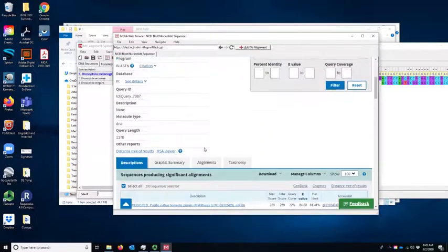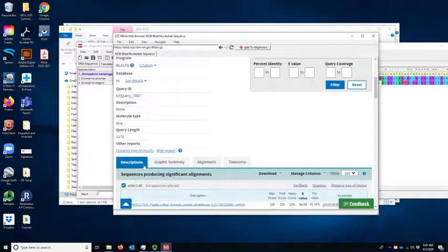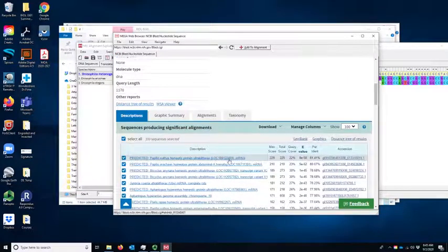You've got at first a list of all of the matches, a description. And so you have the name of the sequence. The species usually comes first. If it says predicted, that means that it was a DNA sequence and they haven't done any experimental procedures other than just translating the DNA sequence and comparing similarities. They haven't done anything additional to confirm that this is actually that protein. But those predicted ones, those algorithms they use and the comparisons are very, very good. So predicted is usually, 99.9% of the time, yes, it's that gene, and they've identified it.